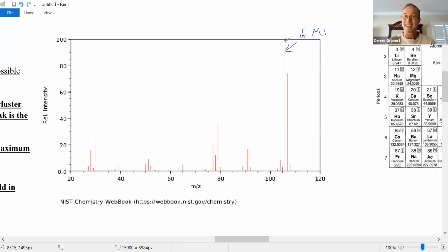Base peak's the biggest peak. So most of the time this peak shows up in the mass spectrometer. This peak's also showing up a lot too. The isotope peaks are rare, right? Only 1% is C13, only 1% deuterium. Those should be little peaks. Okay, so here the little guideline, the largest peak in the rightmost cluster should be your parent. It didn't work out because this one's too big.